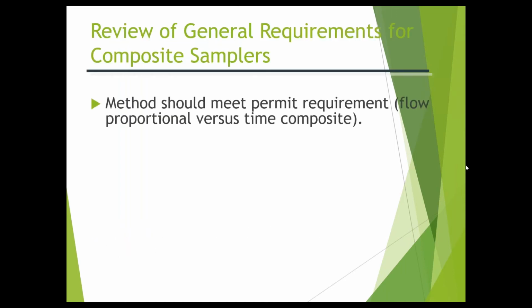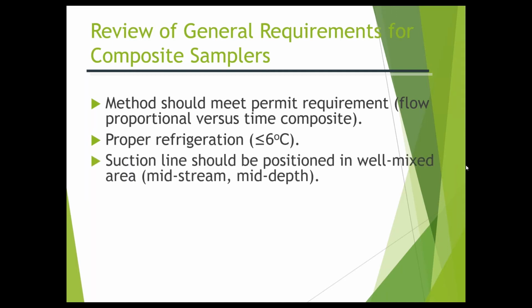So let's review. The method should be permit requirements. Proper refrigeration, less than 6 degrees C. Suction line should be well positioned, midstream, mid-depth.